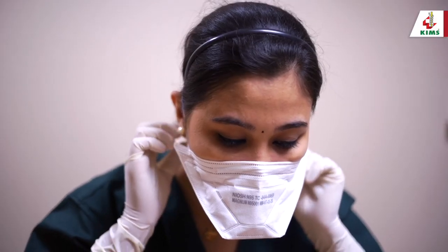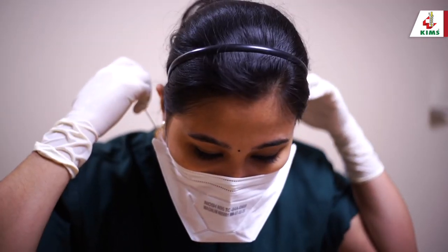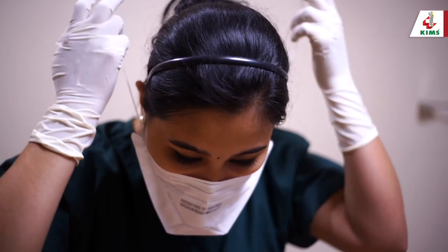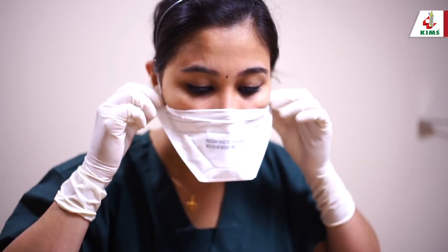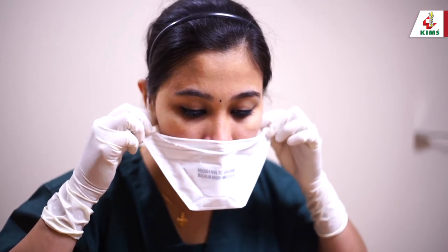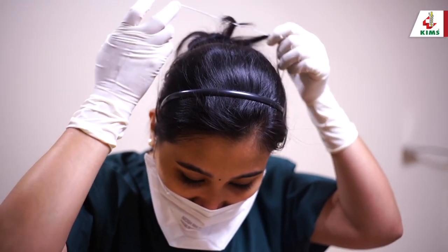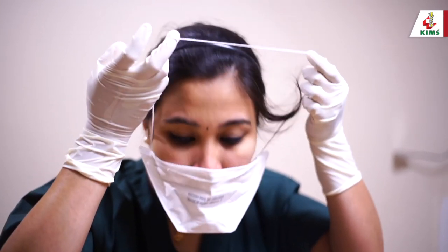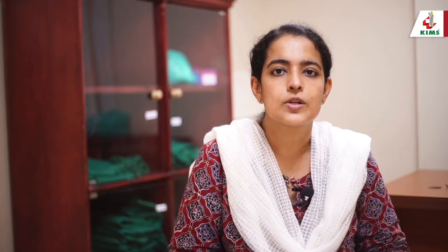Now remove the N95 mask by stooping forward and pulling the lower strap first, bringing it forward, then loosening the upper strap and bringing it forward. Discard the mask holding the straps alone — do not touch the front of the mask. Perform hand hygiene again.